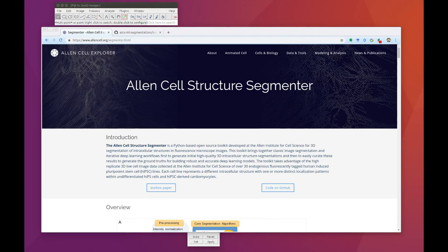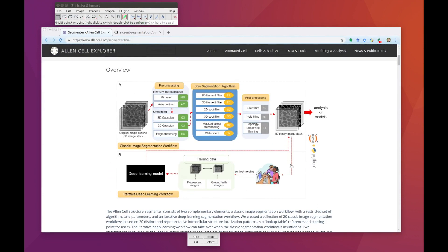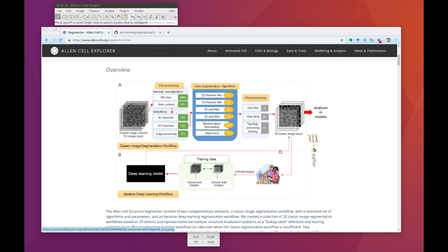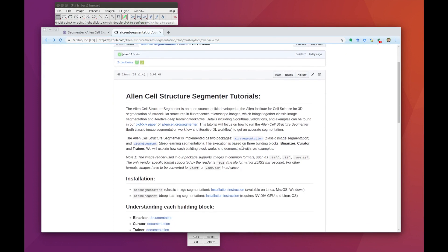Welcome to the video tutorial for the Allen Cell Structure Segmenter. In this video, we are going to review how to use our Python-based toolkit to segment 3D fluorescent microscopy images, combining classic image segmentation with deep learning. This picture is an overview of our toolkit, and more details can be found in our bioarchive paper. In this tutorial we're going to be focusing on an iterative deep learning workflow. This tool is open source and you can find all the code and documentation on GitHub.